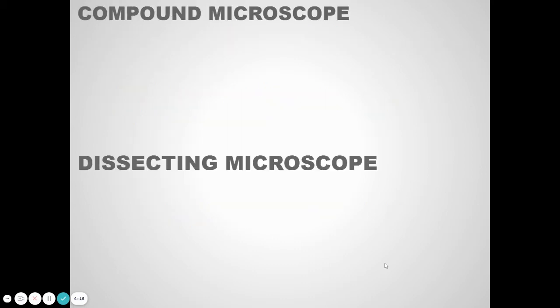So we use a couple different microscopes. The one you're going to be using today is called a compound microscope. I'll grab it for you so I can show you. This is a compound microscope. I'm sure you've seen them before.